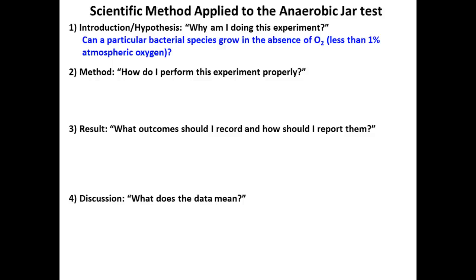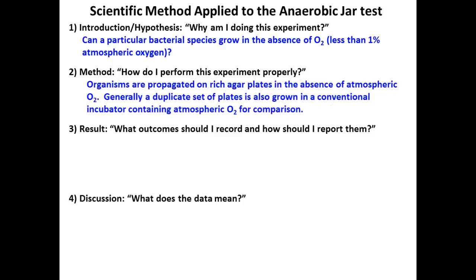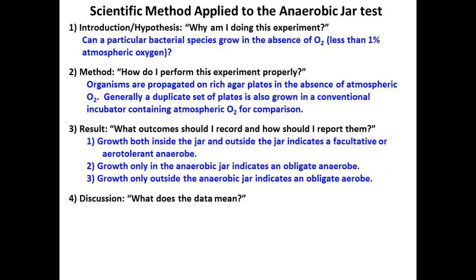That is the question we're asking when we perform that experiment. Again, we've got to put organisms in. We have to put the gas pack generator in it. We have to actually generate that anaerobic environment in order for the experiment to work. And then we look at the different growth patterns to determine their ability.